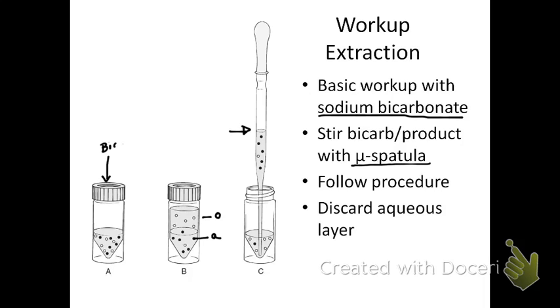because water is very adhesive, or cohesive, to the glass, you can see these little bubbles stuck to the sides. As I instructed some of you in the previous extraction lab, the simplest thing, rather than drying all that, is to simply use a dry pipette, suck up the organic layer, and put the liquid into a dry conical vial for distillation. Before you do that, put it in a dry conical vial or a dry container, and then add your sodium sulfate to that to dry it.